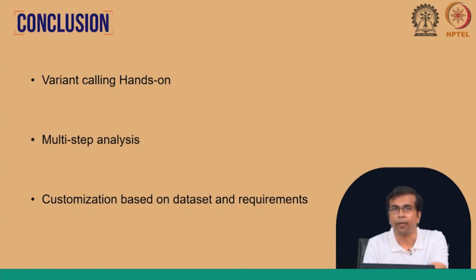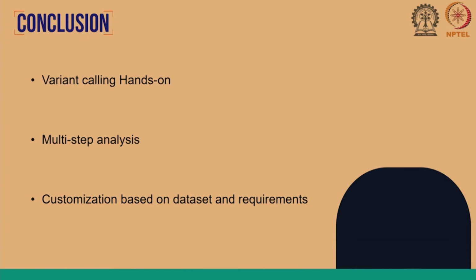So, we have learned how to do the variant calling ourselves, and we have seen this is a really multi-step analysis, and of course, within a very short period of time it is not possible to show all the steps, all the options that are available, and we can also customize these options based on data sets and requirements.